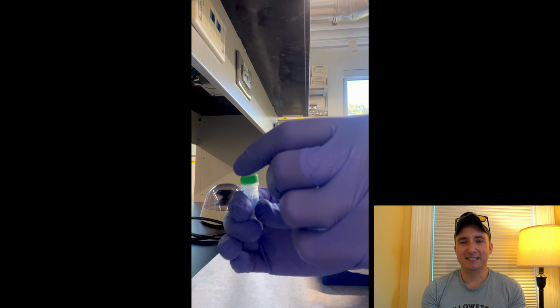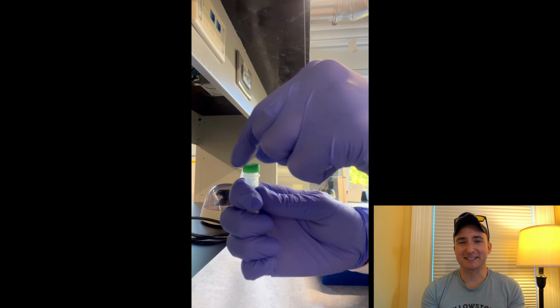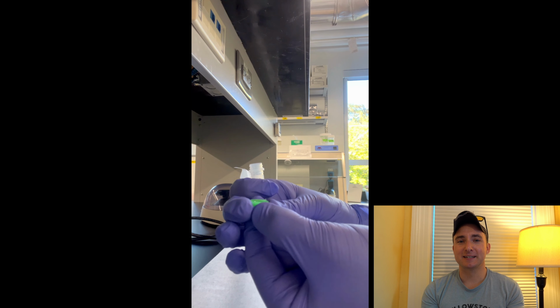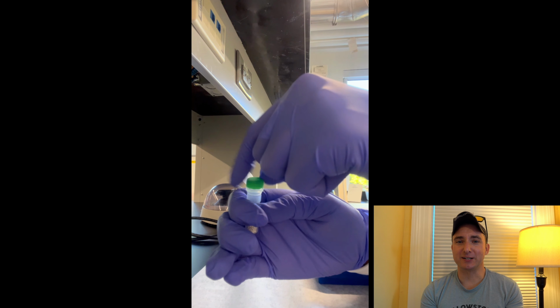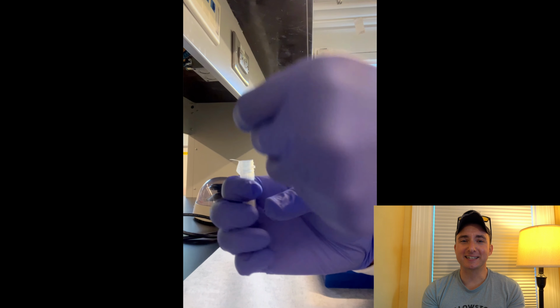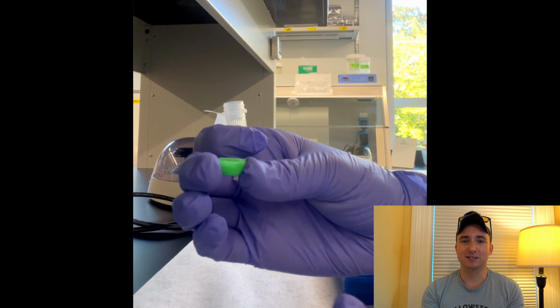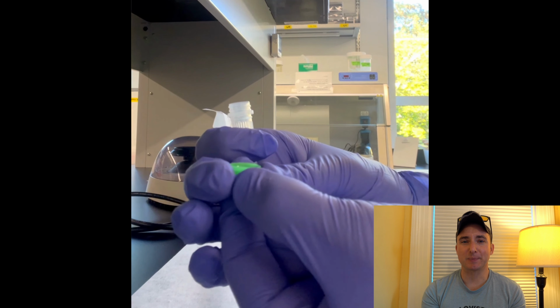And so one of the techniques that I encourage people to practice and train on is just holding that lid in their fingers so that they're not putting it down on the bench at all. This is proper sterile technique, just moving the lid back and forth between your fingers and the tube as quickly and smoothly as possible.